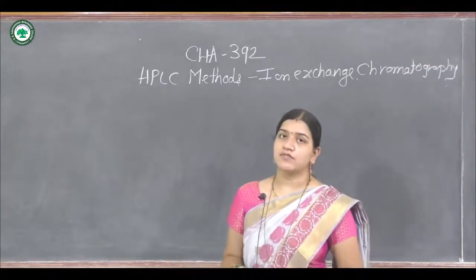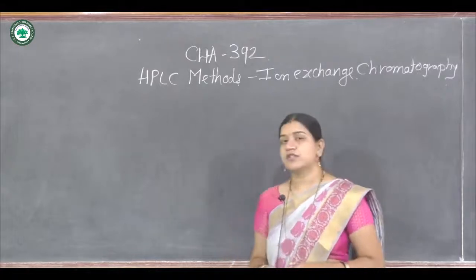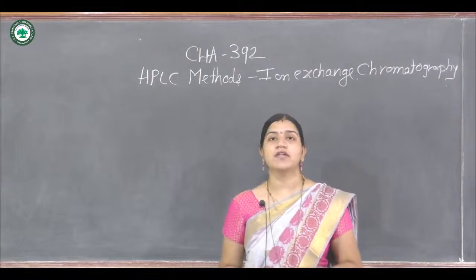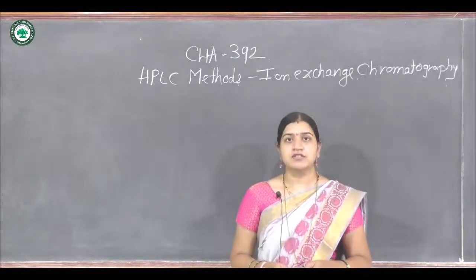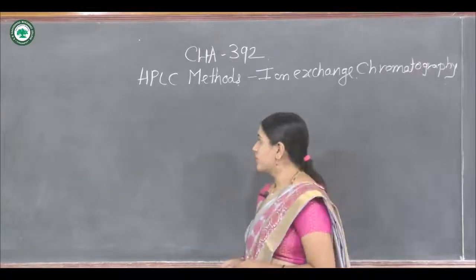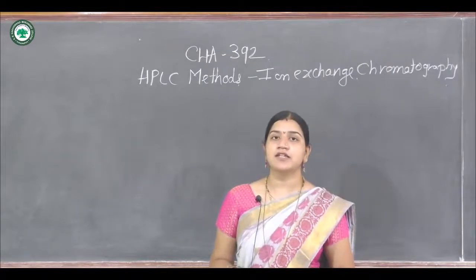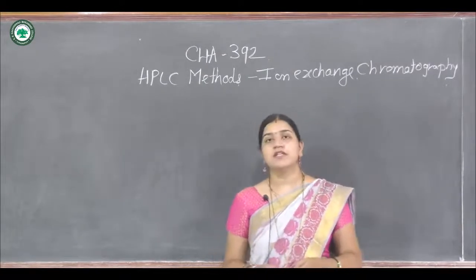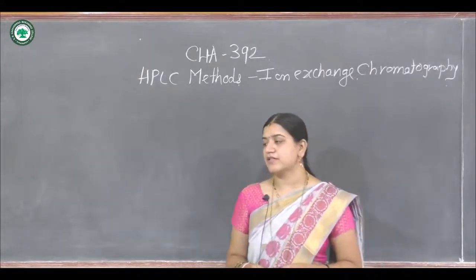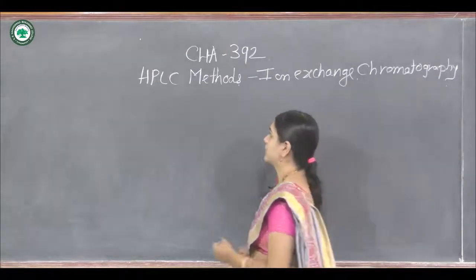In the last lecture, we were discussing ion exchange chromatography. We discussed how the mobile phase influences an ion exchange, and also the different types of ion exchangers, that is the cation exchanger and the anion exchanger, along with the types of ion exchange. Now our next point of interest is the practical hints about ion exchange chromatography.